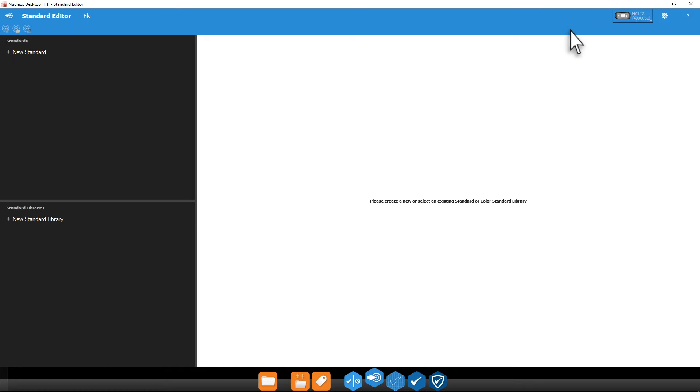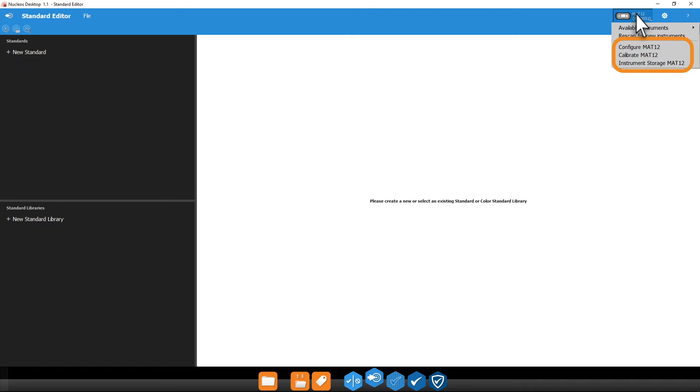Once connected, you can also use this menu to configure your instrument settings, perform a reference tile calibration, and manage your device's storage.